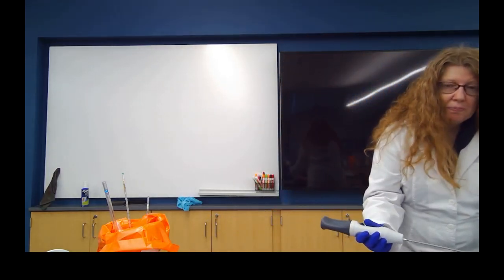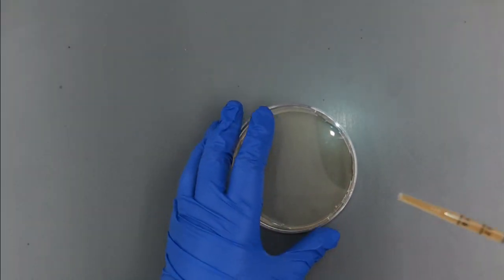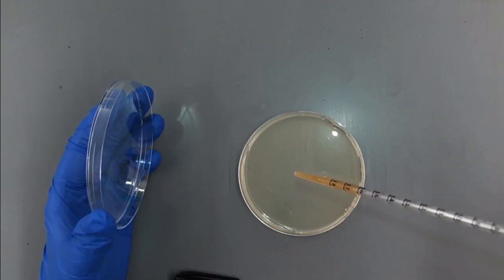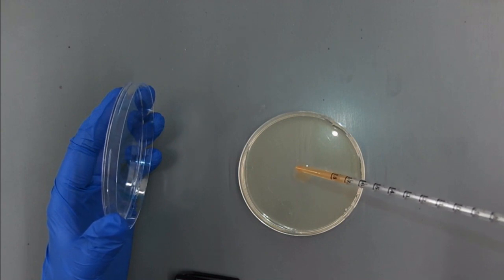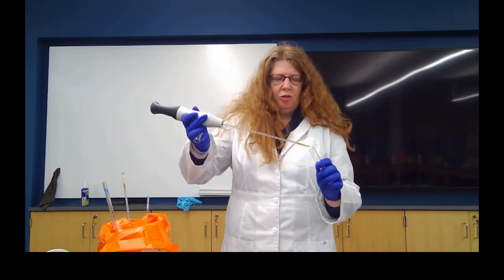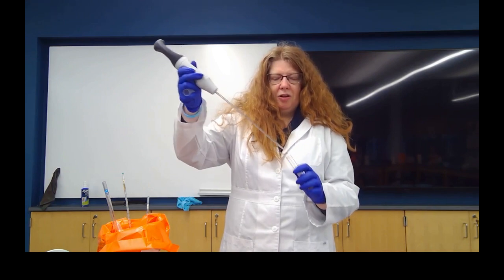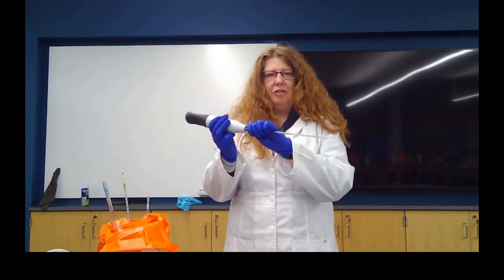And I'm going to use my pipette to deposit 0.1, or 1/10 of a milliliter, onto the surface. Now again, because the only thing this has touched has been the culture, I am able to return it to the tube. Recap the tube, and I'm going to dispose of the pipette.